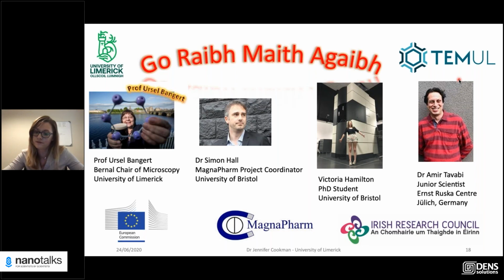As you might have guessed, I am a colloid chemist, and particle interactions are my bread and butter. So when I see particles going like that, there has to be a number of forces in place, and that's why my interest. I know crystallization is when they are falling out of solution. Nature forces them to be crystalline or amorphous, but some of them were chain-like, and that's very interesting because we need to know how particles come together.